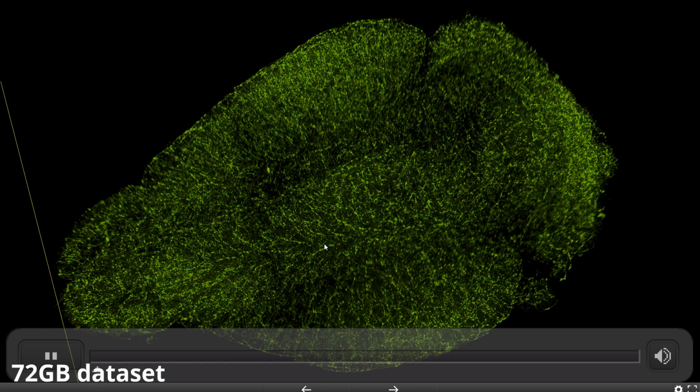But we also did a reconstruction on the vasculature as well, and that's intricate, small structures. So the new model is basically giving you the ability to measure these massive structures instead of having to put them into pieces and measure them in parts.